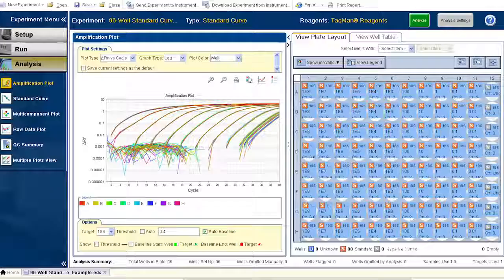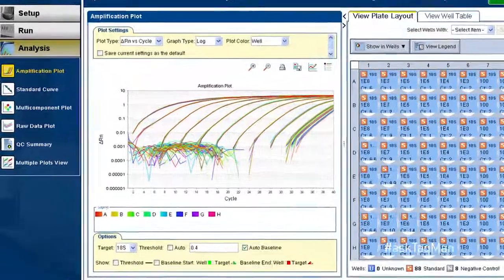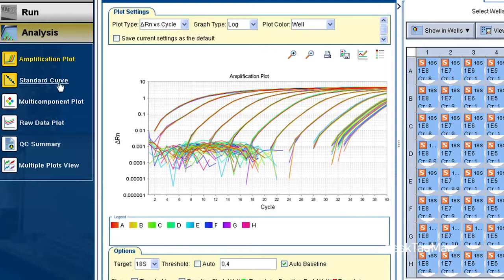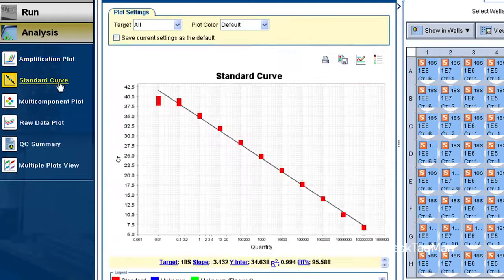Happily, with all newer AB instrument software, the efficiency calculation is already done for you. Just go to Results, Standard Curve, and there it is.